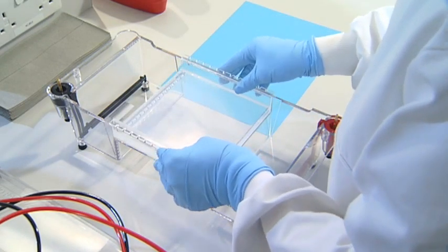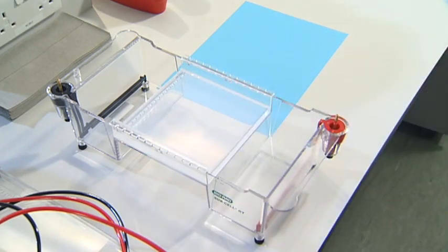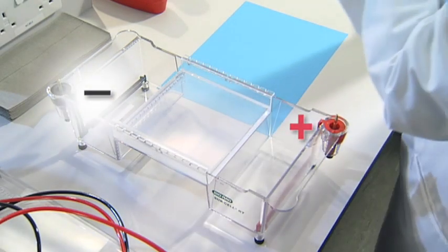Put the gel on the platform in the gel tank in the correct orientation. Remember that nucleic acids are negatively charged, so they'll run through the gel towards the positive electrode. The connector to the positive electrode is coloured red and the connector to the negative electrode is coloured black.